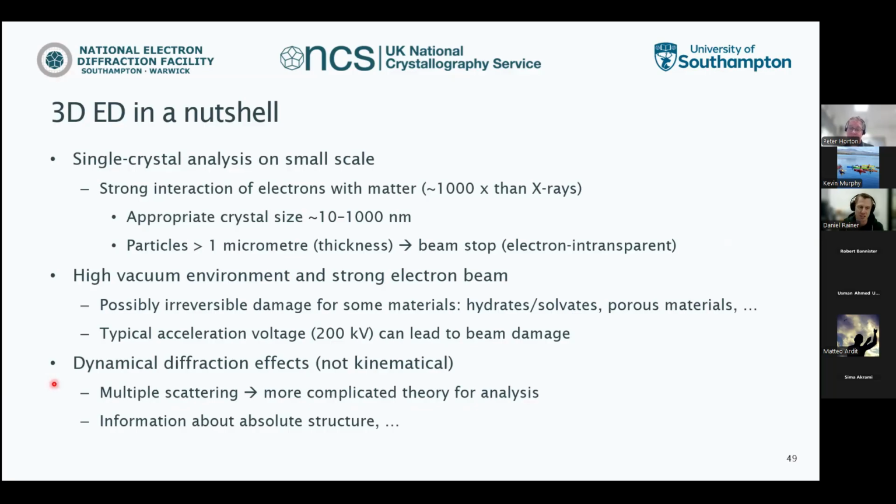However, it's not good nor bad. It's just how it is. It's just a bit more complicated. But these dynamical effects also carry with them additional information. So, for example, absolute structure, which is obviously very important for pharmaceutical compounds, can be obtained directly, and no special considerations need to be made in, for example, the data collection.